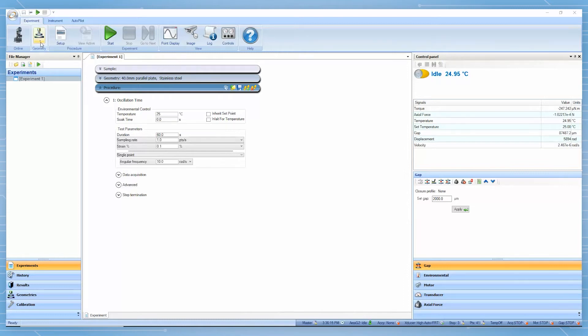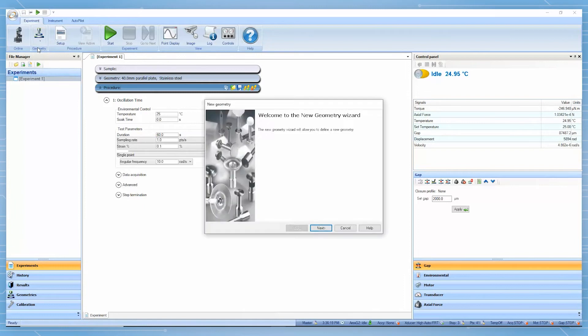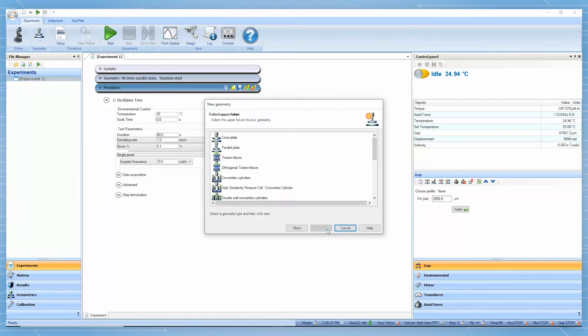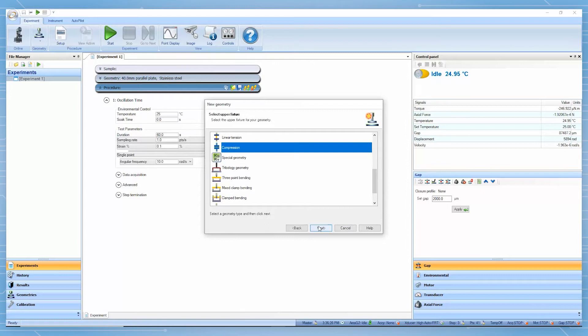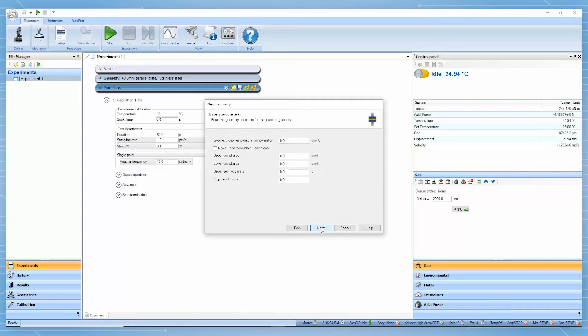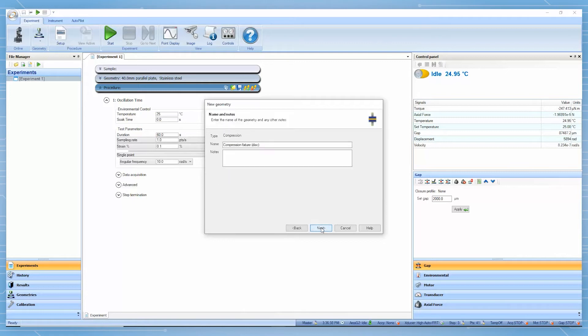Under the geometry list, click on add new geometry. Then, select compression. Choose the correct sample dimension, for example cylindrical. Follow the procedure to finish creating this geometry file.